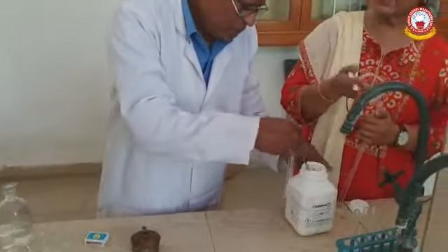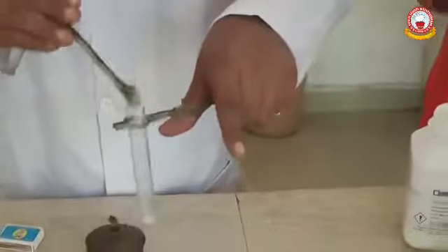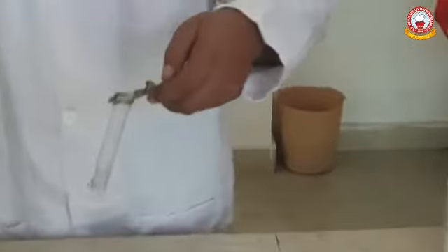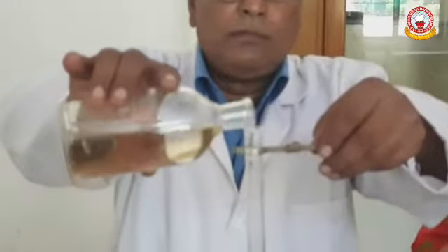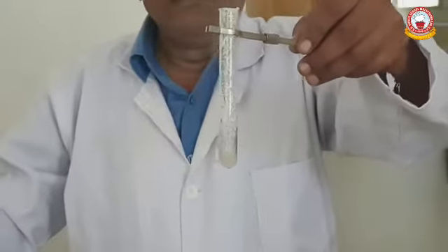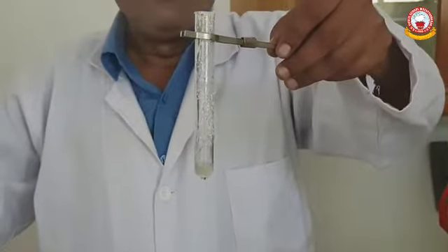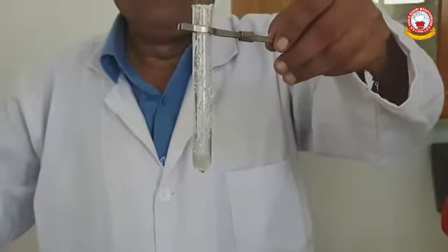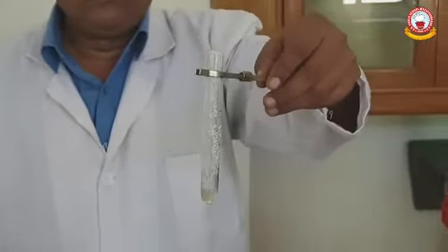First we will clean the test tube, and now we will add a pinch of the salt, not very much, in the test tube, and we will add concentrated sulfuric acid and just see what change occurs. Yes children, you can see the pungent gas coming out, and it nearly confirms that this radical is of second group, whose reagent is concentrated sulfuric acid.